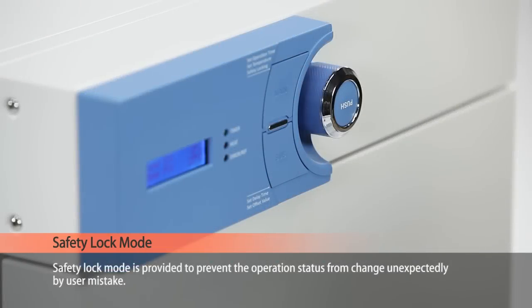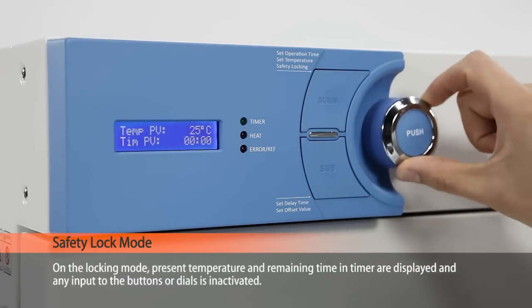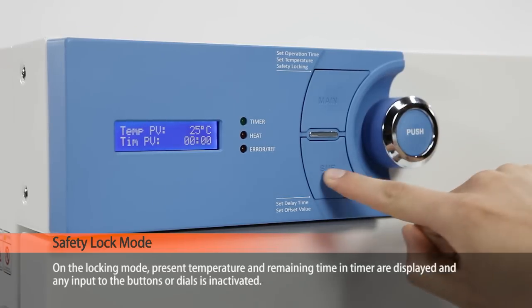The safety lock mode is provided to prevent the operation status from changing unexpectedly due to user mistake. In locking mode, the present temperature and remaining time in the timer are displayed, and any input to the buttons or dials is ignored.